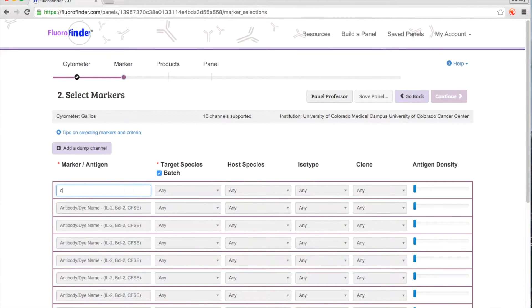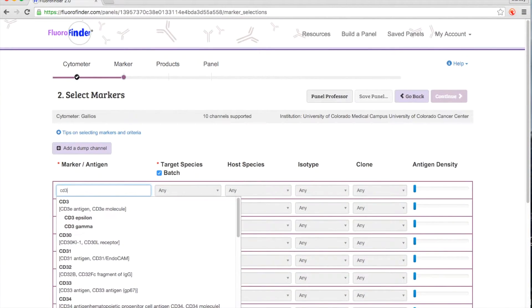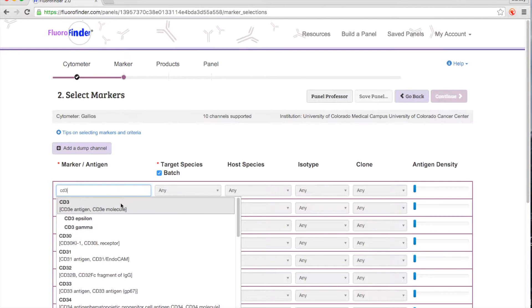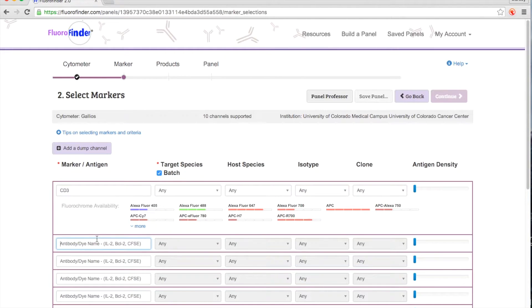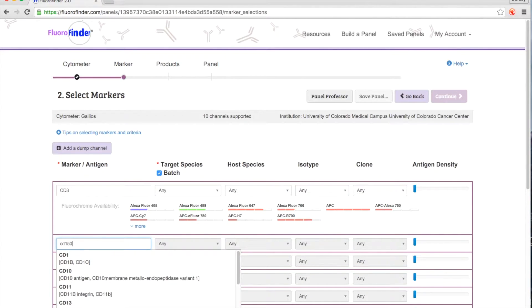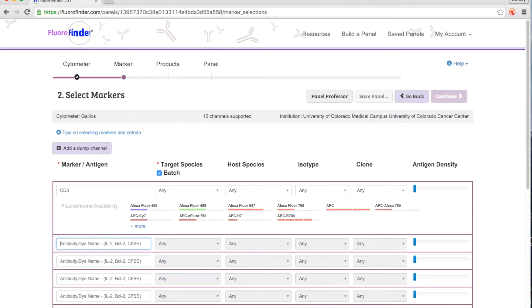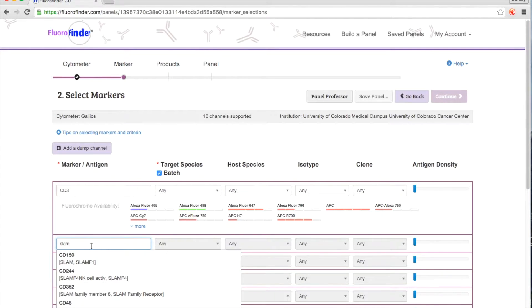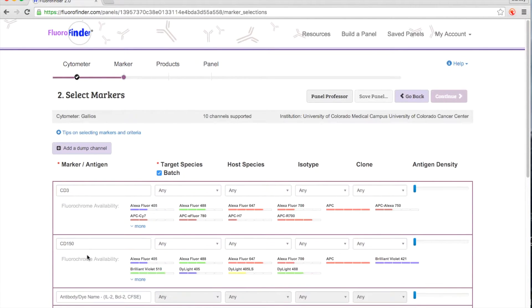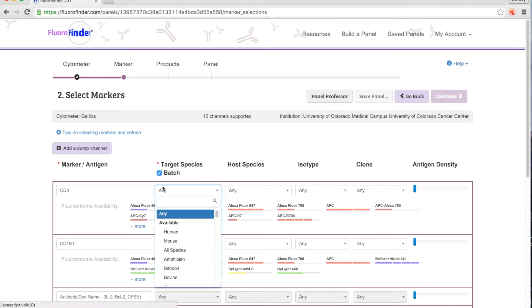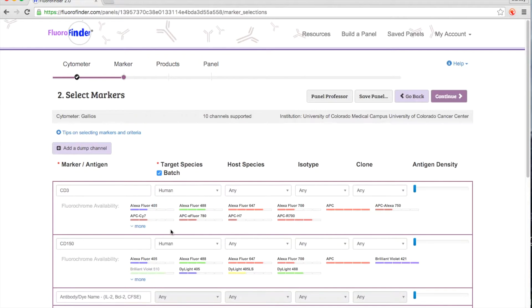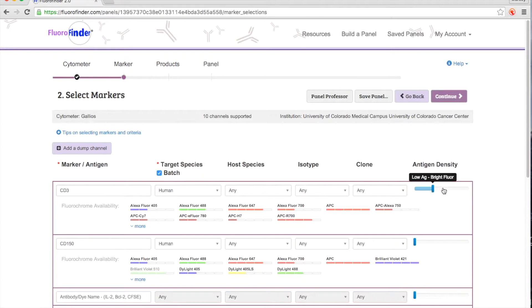On the next page, enter the markers you need for your experiment. Our powerful search engine enables you to quickly find your marker of interest using either the primary name or an alias. Plus, you can further refine available products based on isotype, clone, and antigen density.